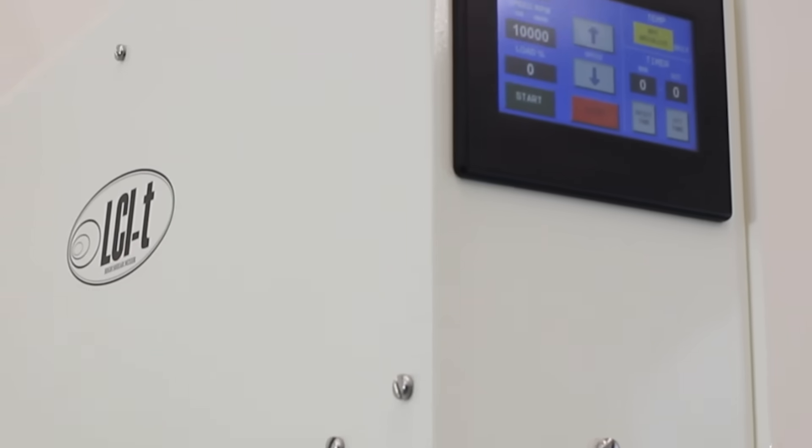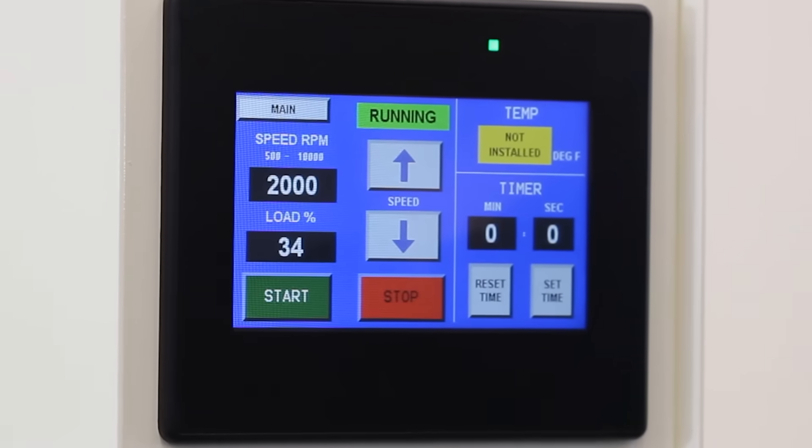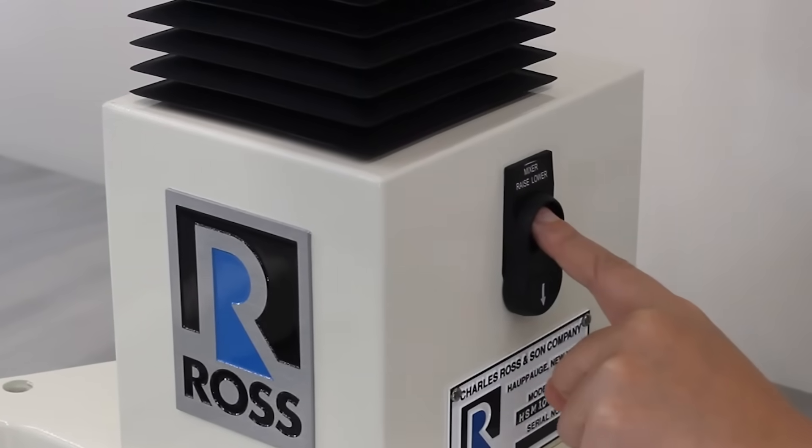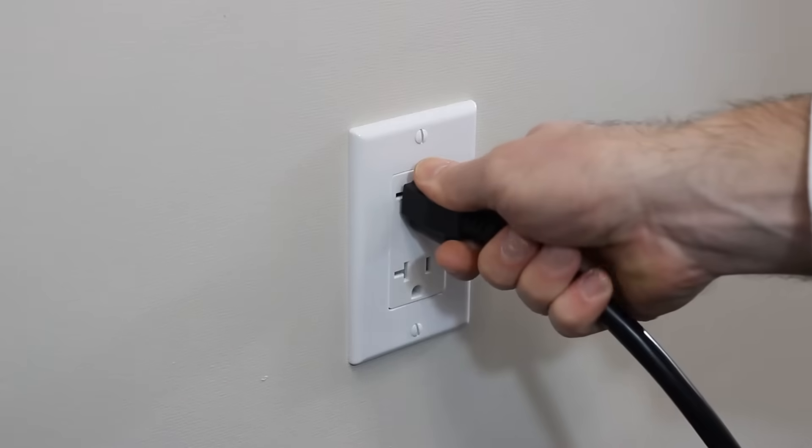The LC-IT features a touchscreen interface with speed display, cycle timer, and readouts for temperature and power consumption. A user-friendly raise-lower lift control operates from standard outlet voltages.